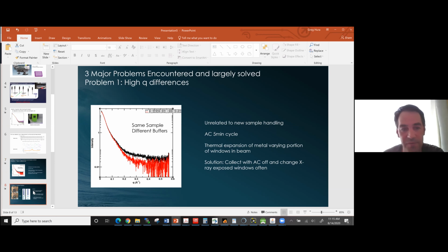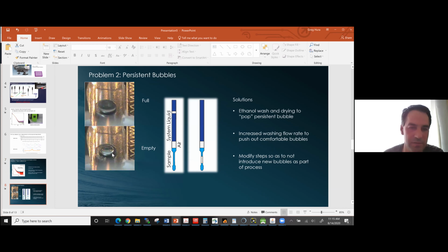We have had bubbles in the past. So here, this is when we're using metal needles instead of 3D printed needles of plastic. So the cells look different. But we had bubbles, so you can check through your samples for bubbles. So please do that. Generally, we provide a set of images for each sample while it's being collected. So there's a sample image directory where you can look through it. And again, I'm focusing on the tough stuff, right? So things to look out for.